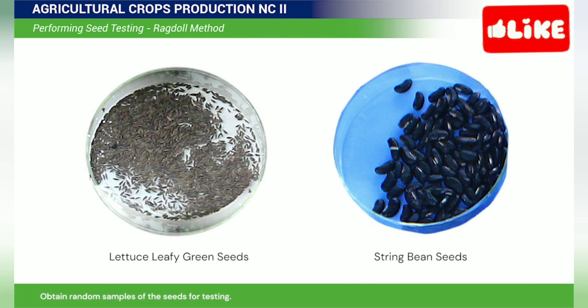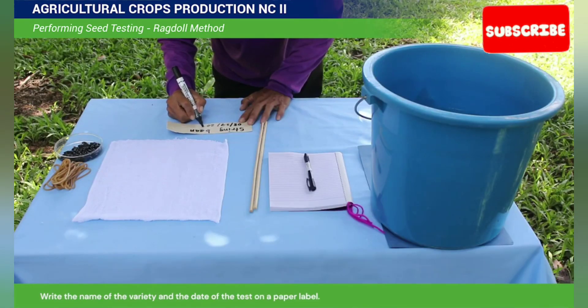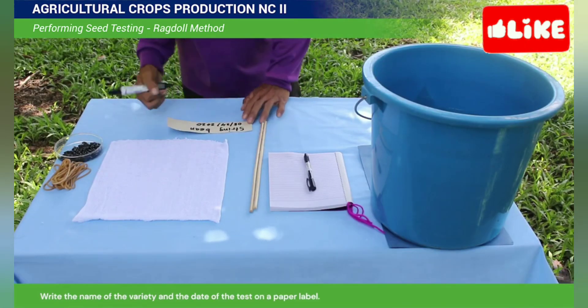Obtain random samples of the seeds for testing. Remove the empty ones from the sample. You should have a total of 100 field seeds. Write the name of the variety and the date of the test on a paper label.